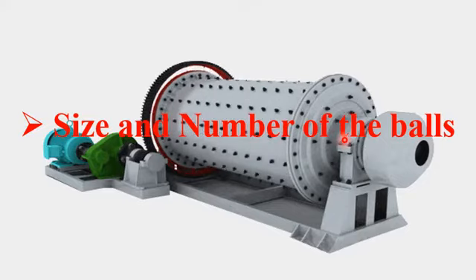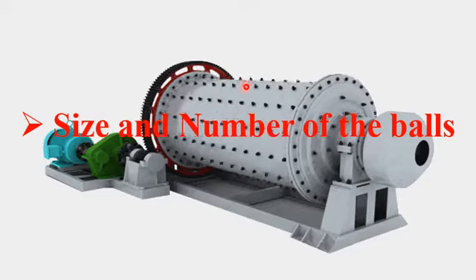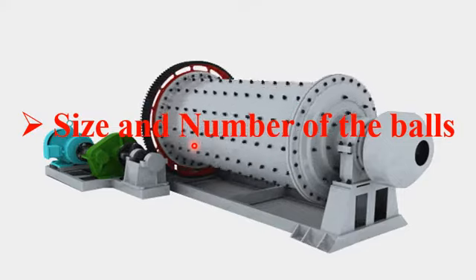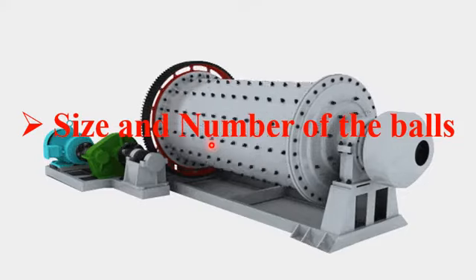However, the converse is the case if we use a higher number of balls inside the ball milling apparatus. If the number of balls is more, the consumption of time will be less and we will get fine nanoparticles in lesser time.